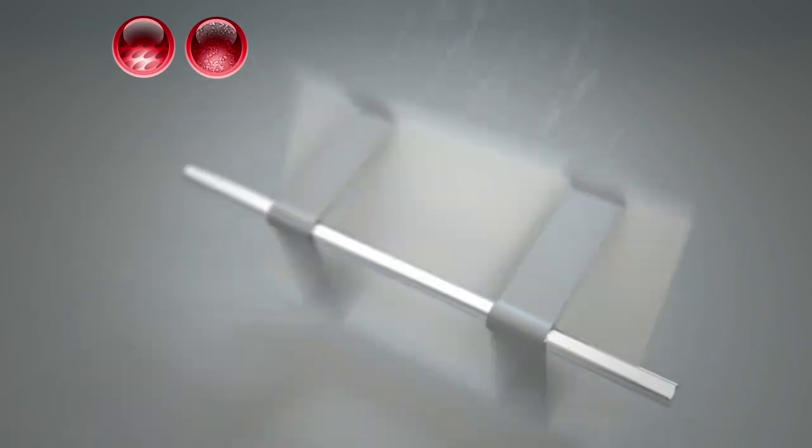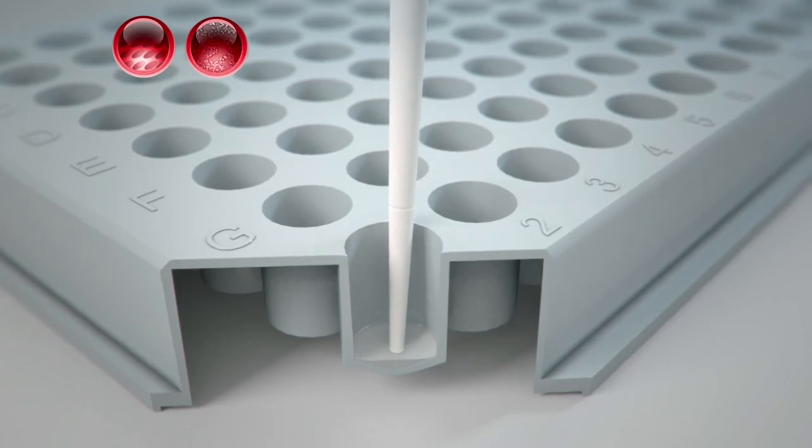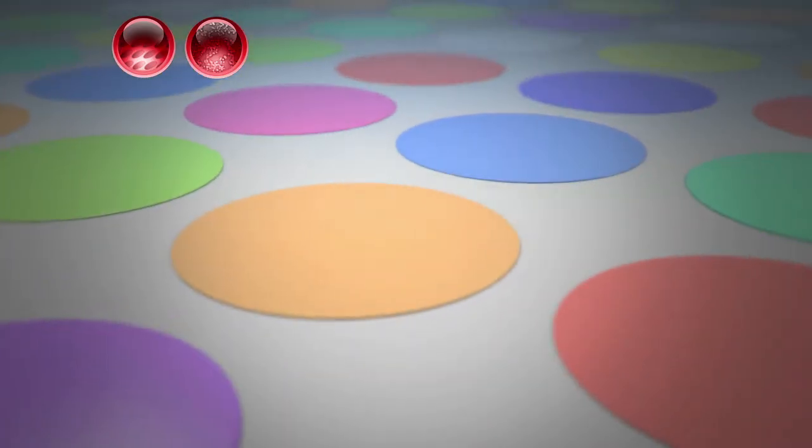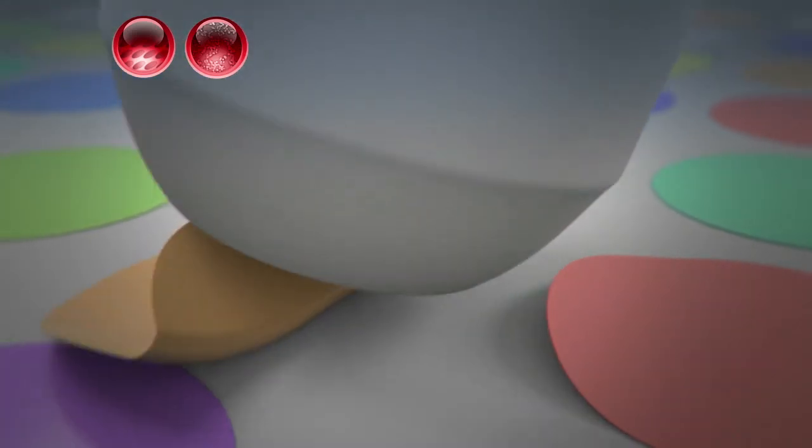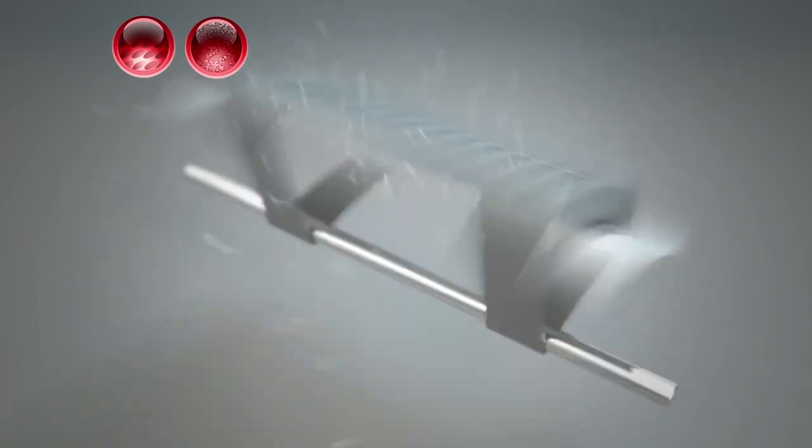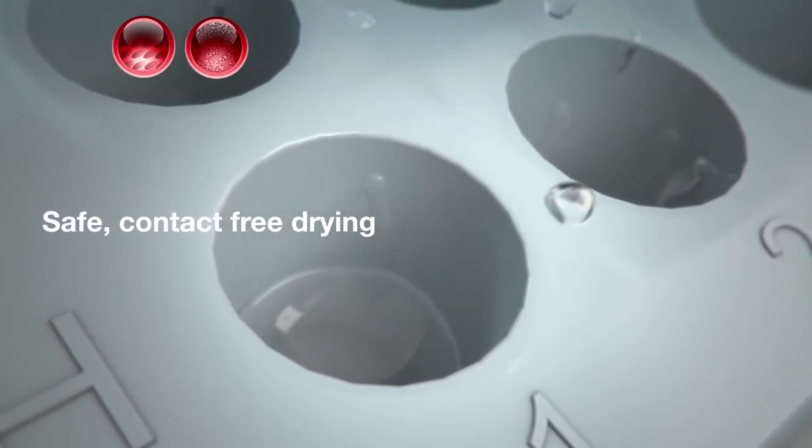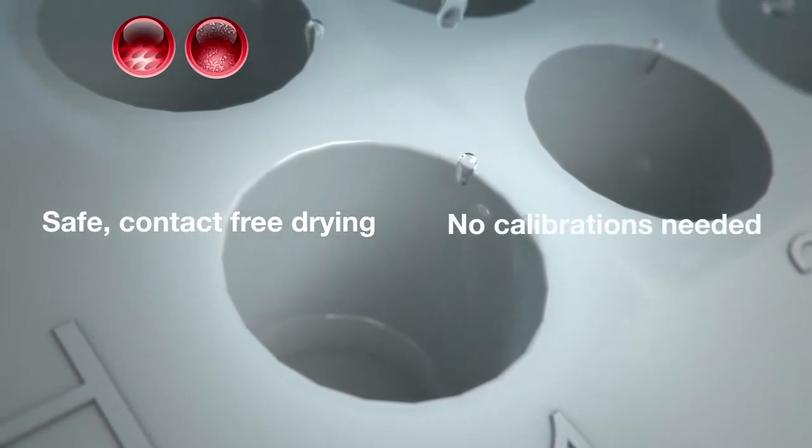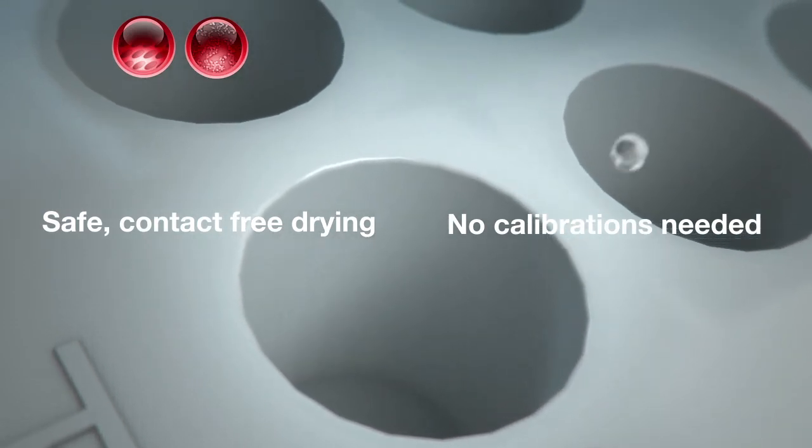The aspiration needles of conventional plate washers pose a threat of disturbing delicate features at the bottom of wells, such as printed protein spots or loosely adherent cells. Because centrifugation is inherently contact-free, plates dry safely without the need to recalibrate aspiration needles so they do not touch well bottoms.